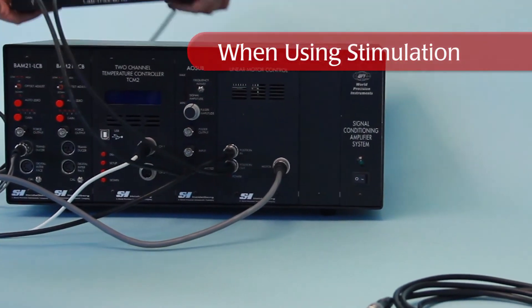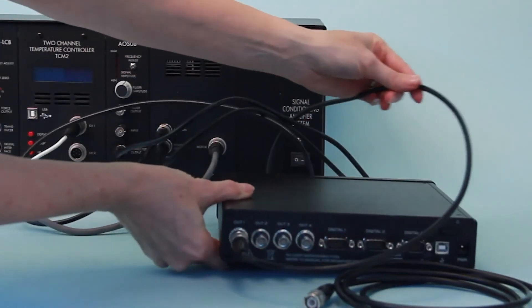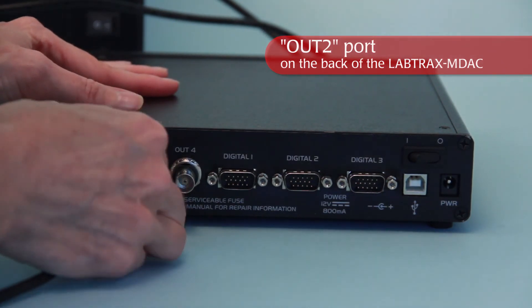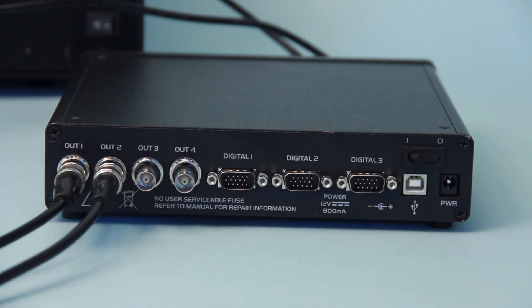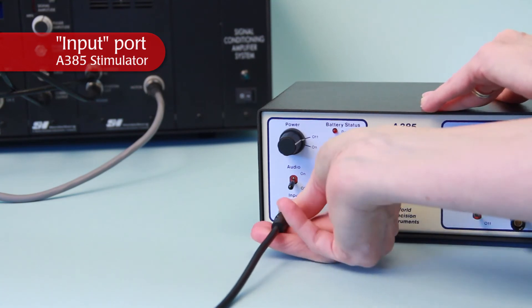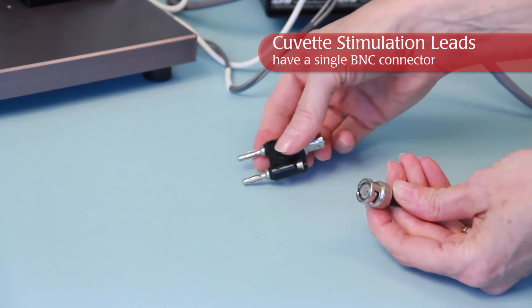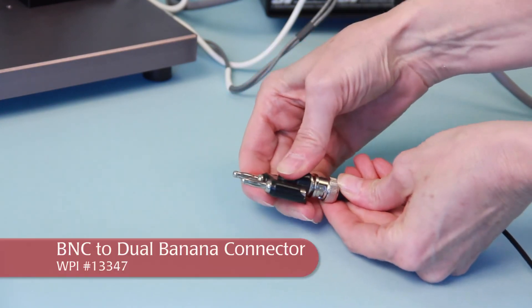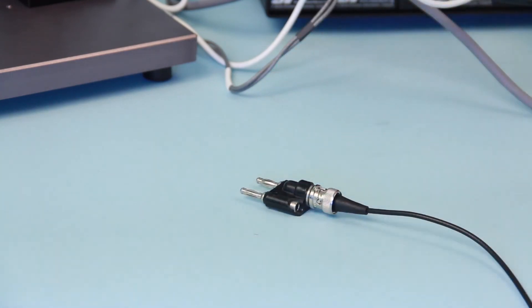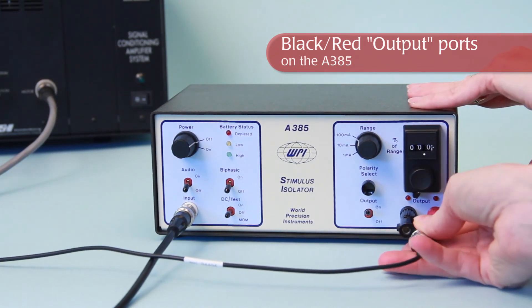Connect the cable from the motor to the motor port on the linear position controller. The contraction of the tissue is controlled by another analog output on the data acquisition system designated for stimulation protocol. Connect a BNC cable to the socket on the back of the data acquisition system labeled OUT2, and connect the other end to the socket on the front of the stimulus isolation unit labeled input. The stimulation leads from the cuvette have a single BNC connector. Connect the BNC from the leads to a BNC to double banana connector, then plug the dual banana connector into the black and red output ports on the front of the stimulus isolator.